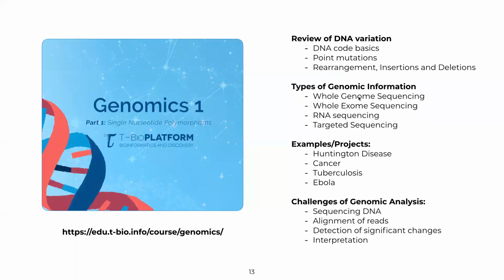We're going to talk about the types of information that are involved in genomics, whole genome sequencing or whole exome sequencing. We'll also talk about RNA sequencing and targeted sequencing. There are example projects for you to learn about, one having to do with Huntington disease, which we'll discuss today, cancer, tuberculosis, and Ebola. And then we're also going to be discussing the challenges of genomic analysis in sequencing DNA, the alignment of reads, and the detection of significant changes, as well as the interpretation of the results that we're getting.